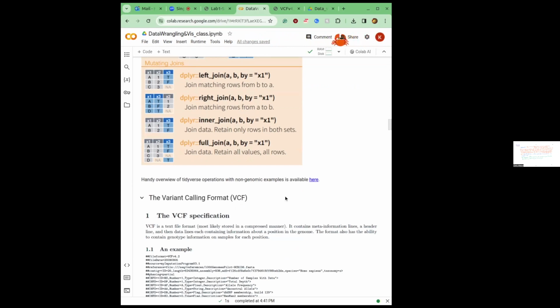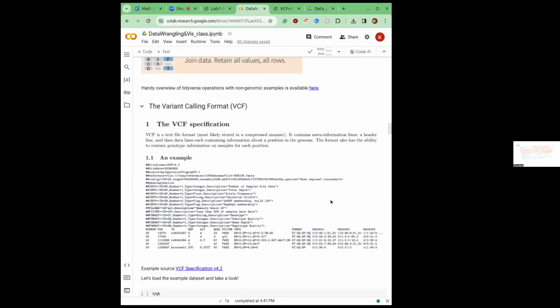All right, and I have a bunch of links in all of this. That truly is only so that you know that there are resources that you can use. So there's a bunch of links throughout this notebook. And this particular one here is just a workshop that I ran before. It has basically what we will go through here with more simple examples for people that might get a bit lost if we go too quickly, but we only have 45 minutes.